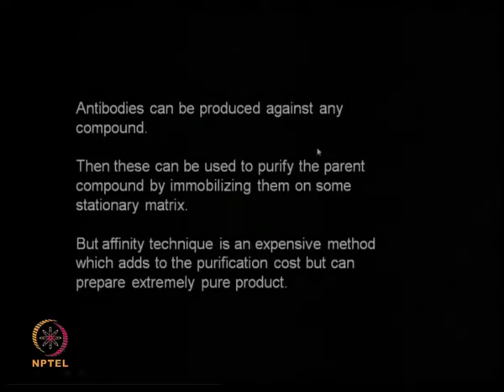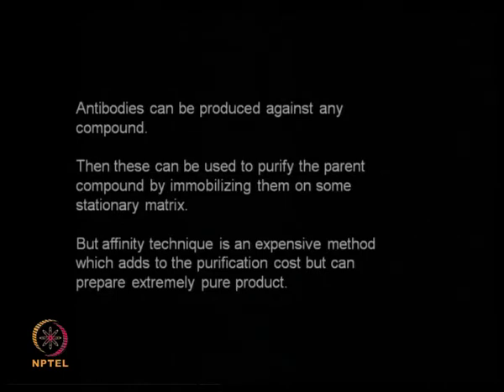Basically, we can produce antibodies for any compound. These antibodies are then immobilized on a stationary matrix, so we can purify the parent compound. If there is a mixture which contains your parent compound with other compounds, the antibodies prepared from the parent compound will be very selective towards the parent compound, and will not bind the rest of the compounds.